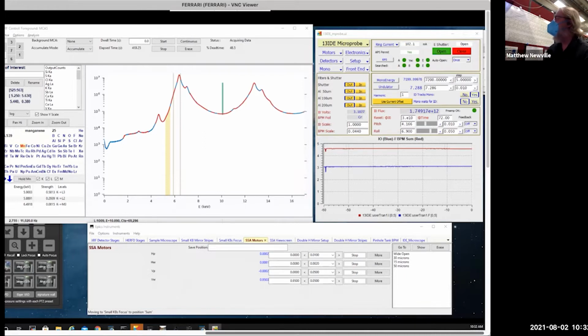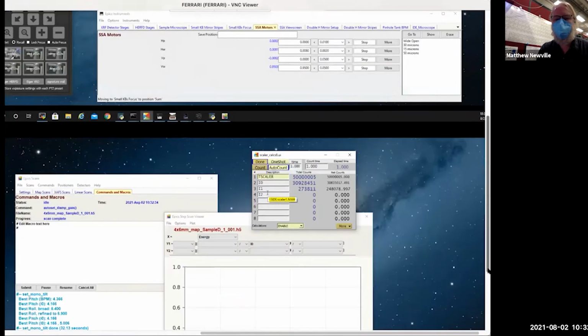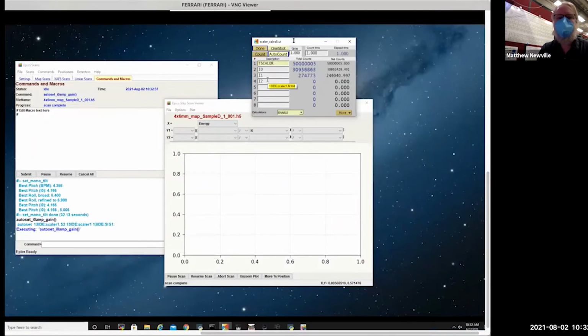And I'll do this for every edge we do, and we'll do several edges. When I show you this, I want to show you the concepts, not so much what we do particularly at a beamline, just to keep in mind that you might need to pay attention to this. It's also totally reasonable to say the beamline scientists should do this for you, because they know the details of their system, and the particulars change at each beamline.